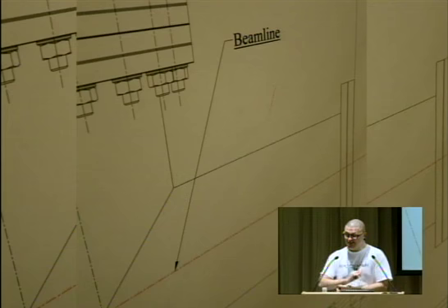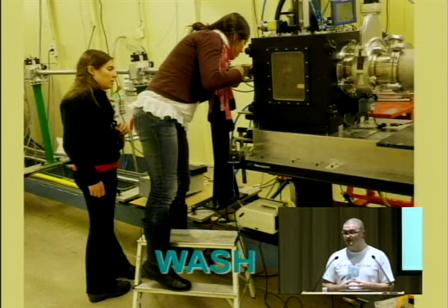I started doing SAXS in 2006, and everything everywhere in the world looked like this. This is the old SAXS beamline in Lund in Sweden. I'm not sure if this beamline still exists. It was used for solution scattering and for powder diffraction. Back then it was a second generation synchrotron with quite a weak beam.